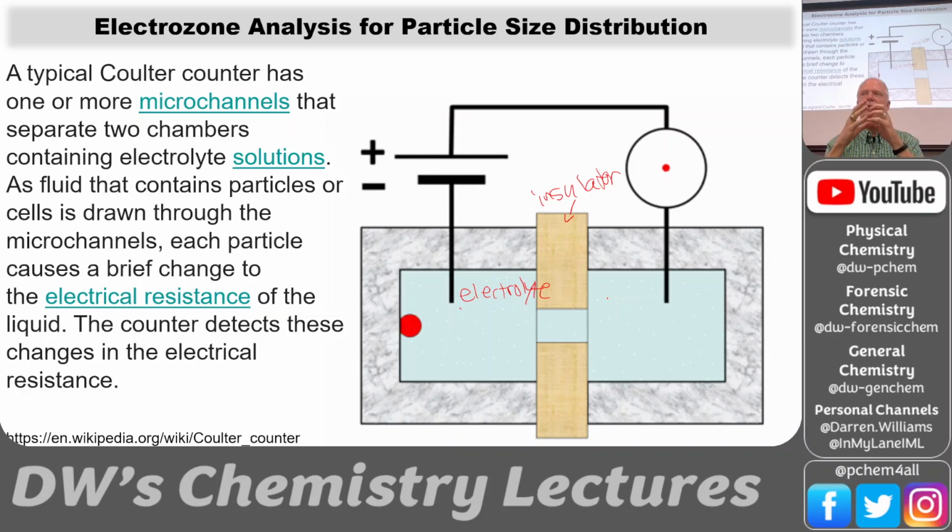So the current changes. So you got a current of ions going through, and ions are really small. You know, cations, anions, they're both going through this passage. If a big old fat particle gets in there and slows down the flow of ions, you can detect it. And now it's pretty complicated, the behavior of that particle in this pore. It's simplified by just assuming the particle is a sphere.